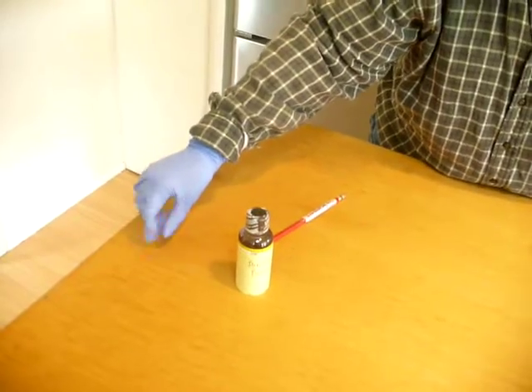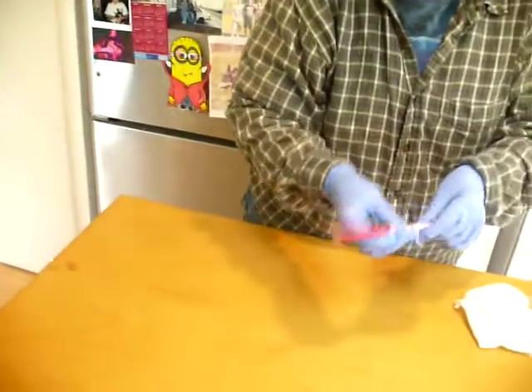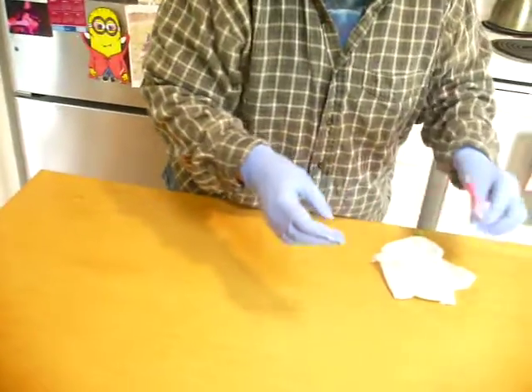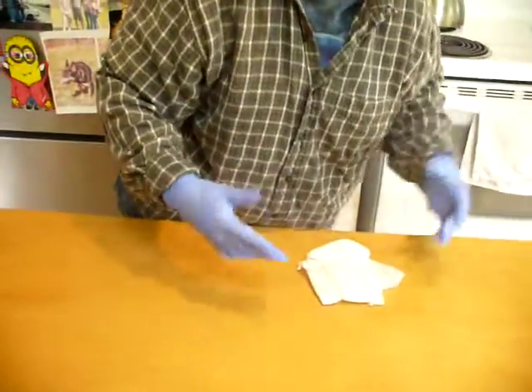I'm going to turn off my Bunsen burner — turn the flame off and the gas off — and set it over here. My inoculating loop has already been flamed, so I'm going to put it in the drawer.